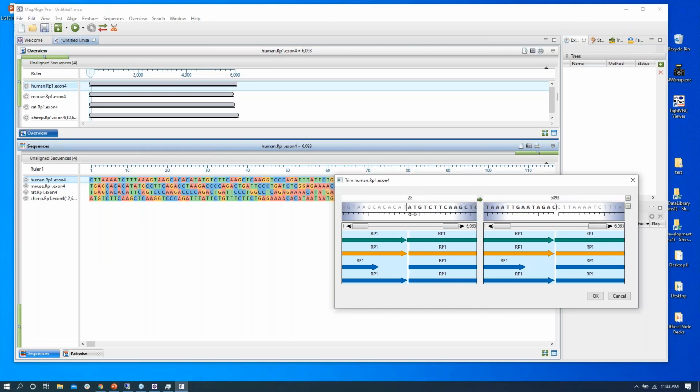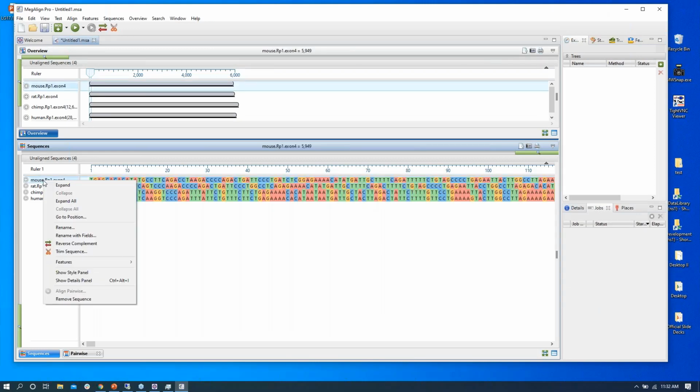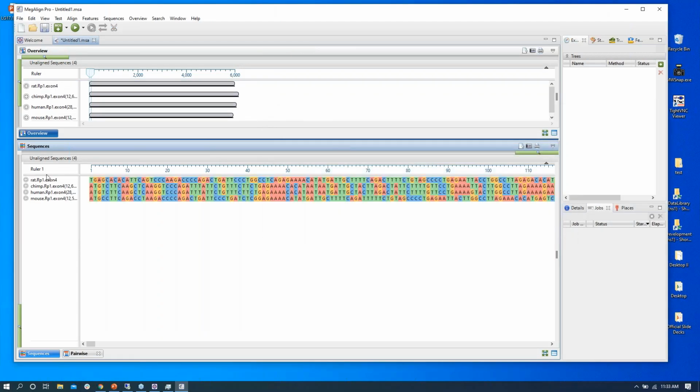So again, a common approach is to just manually trim. And for some algorithms, having the common start point makes quite a bit of a difference for how the sequences align. Not all algorithms, but there are some that are a little fussier in terms of the very start of the sequences. I know ClustalW from years ago was very fussy with the start. I think ClustalW is still fairly particular as well.